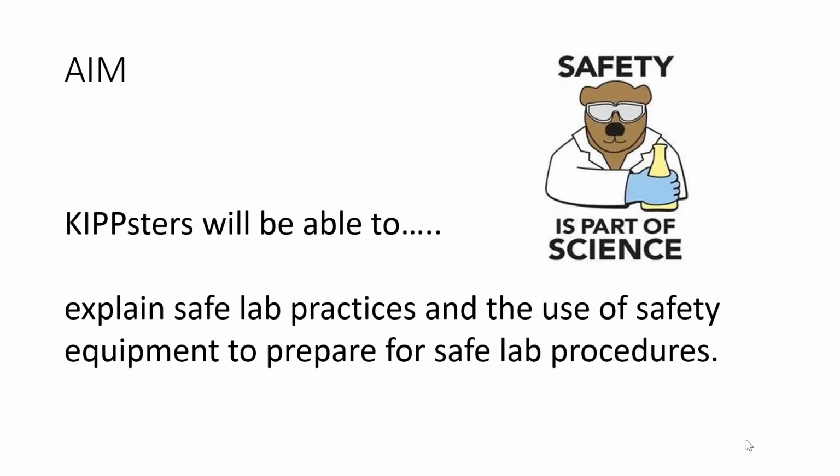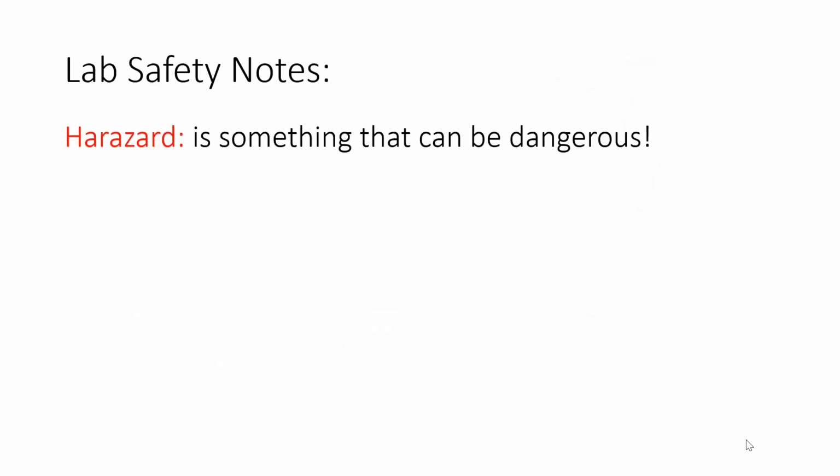Our aim for today, go ahead and read it along in your head with me. KIPPsters will be able to explain safe lab practices and the use of safety equipment to prepare for safe lab procedures. Okay, so it's very important that we learn about safety in this class so no one gets hurt. Now we're going to talk about notes.